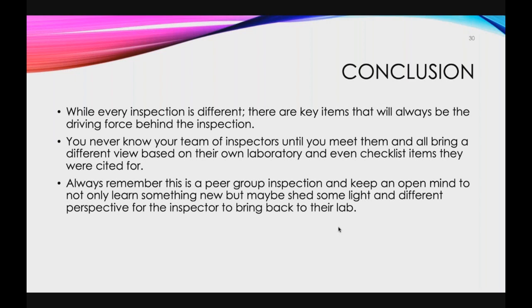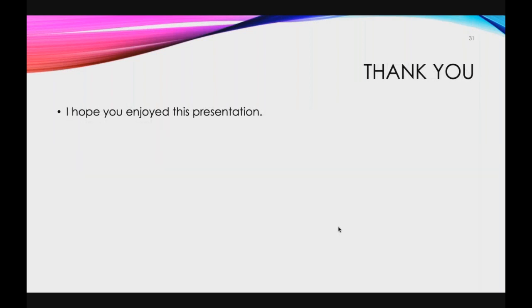In conclusion, while every inspection is different, there are key items that will always be the driving force behind inspection. You never know your team of inspectors until you meet them, and they all bring a different view based on their own laboratory and even checklist items they were cited for. Always remember, this is a peer group inspection, and keep an open mind to not only learn something new, but maybe shed some light and different perspective from the inspector to bring back to their lab.